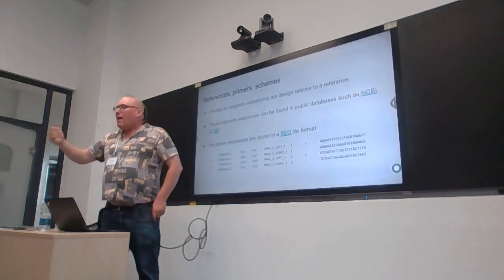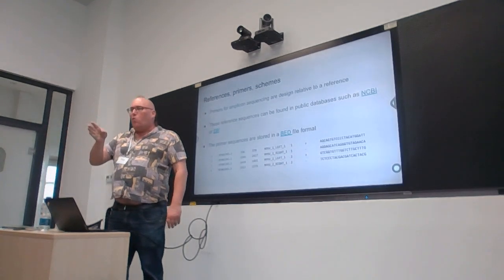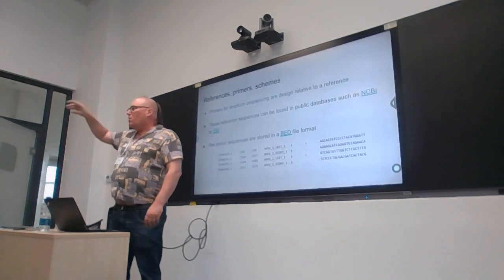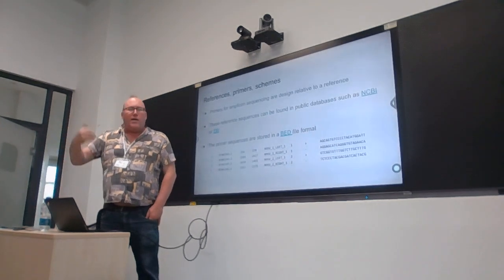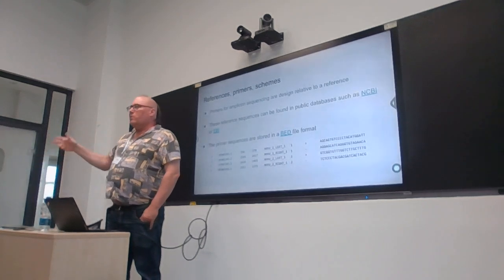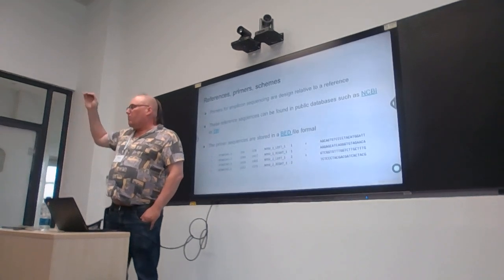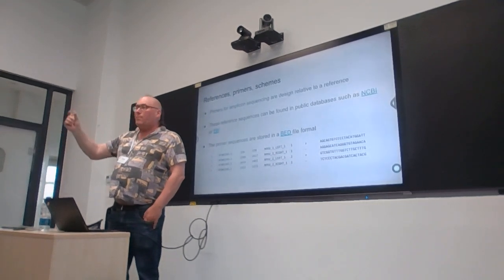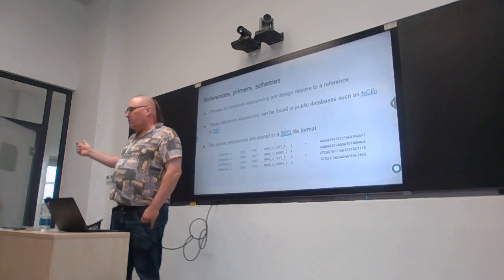The IMAP kit that you get from Illumina, okay? It's like the COVID-seq kit. Remember, COVID-seq was everything built in one. COVID-seq came with primers and the other reagents that you needed all together. IMAP, which African CDC is going to be distributing for Mpox virus, is the same. It comes with built-in primers. And the primers that it comes with are Yale version 1.0.0 primers, okay?